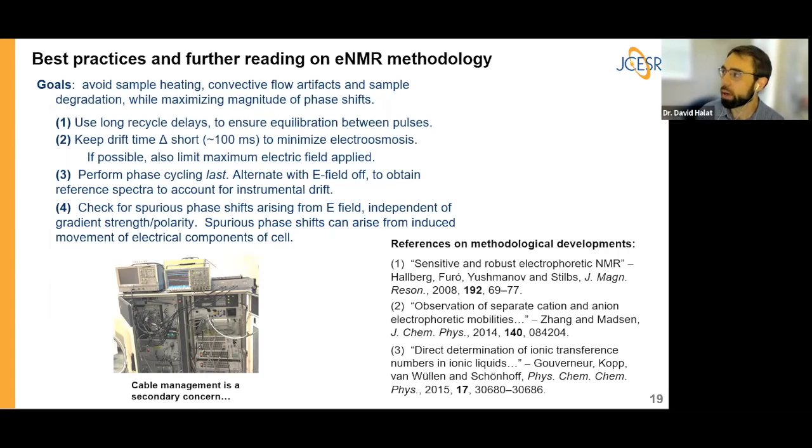Yeah, that is a really good point. It's not something that I've systematically studied in that way. I would suspect that if you were to run a very long experiment where you were sequentially incrementing the voltages like that, in some systems you are going to see degradation, and if you're degrading the sample either early on or later, then you're going to see artifacts related to that. By doing it randomly, that effect is scattered throughout the data rather than, like I said, confined to early times or later times. But I haven't really studied that systematically, but that's a good question.